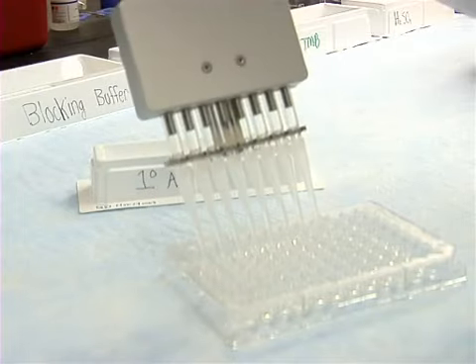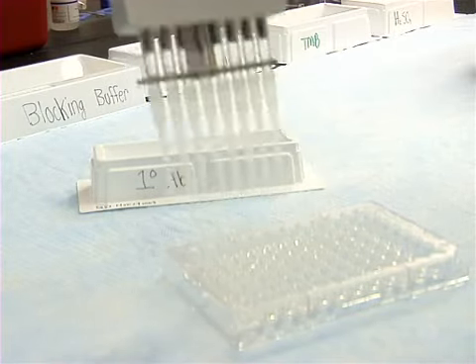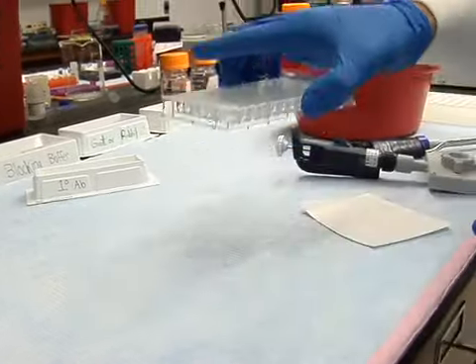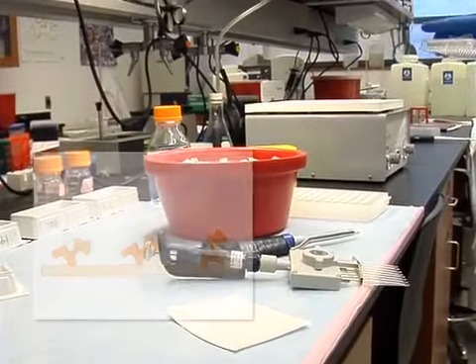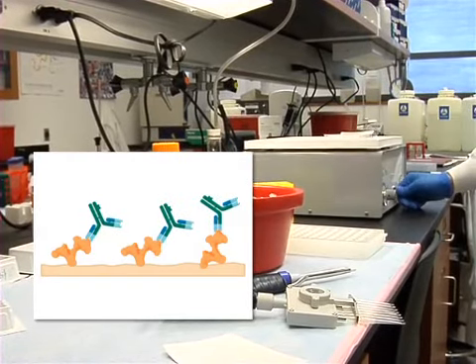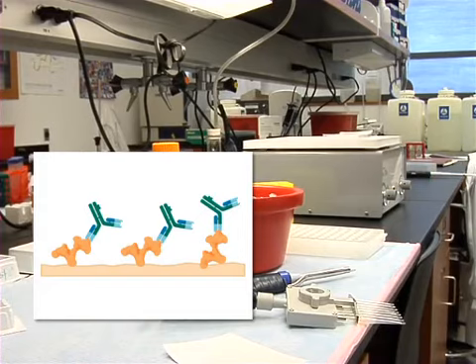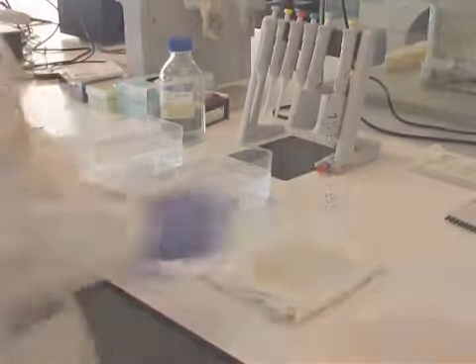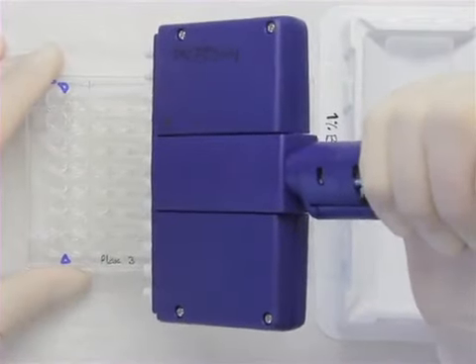Now, it's time to add the detection or primary antibody. The plate is then incubated, usually at room temperature, to allow a sufficient amount of antibody to bind to the target protein for later detection and quantification of the protein. After this incubation, excess antibody is removed and the wells are briefly washed with PBS.